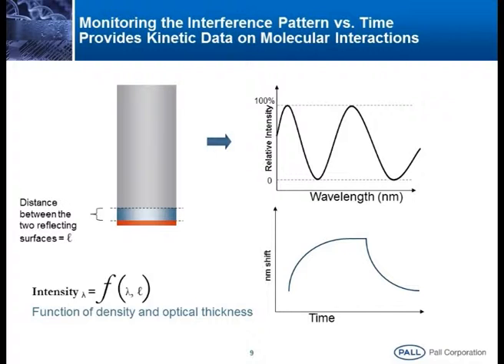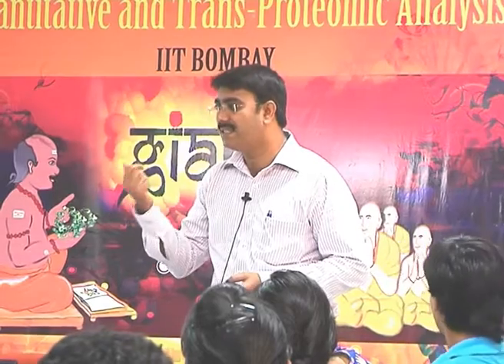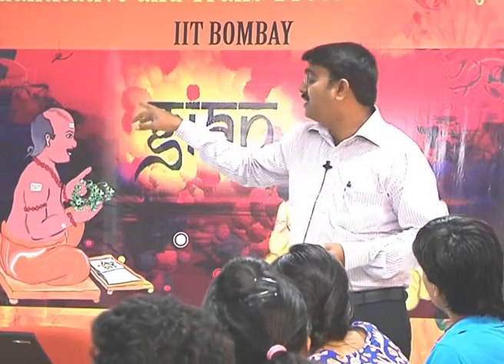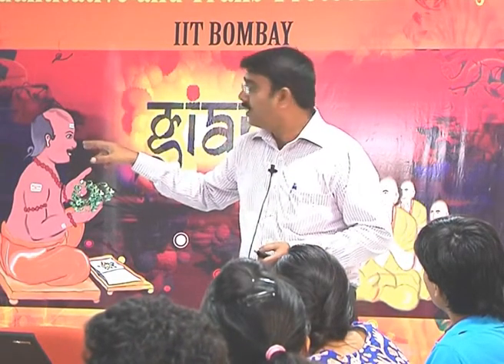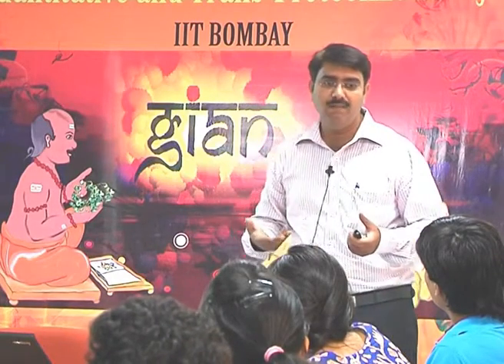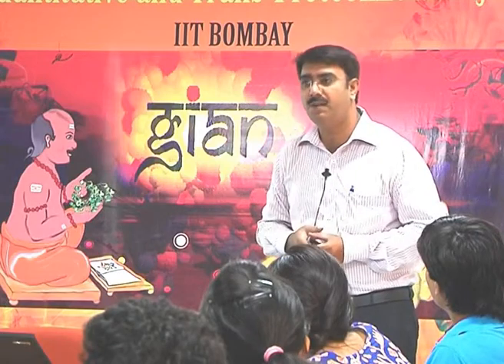affinity. What exactly is picomolar affinity, nanomolar affinity or micromolar affinity? Say suppose in the case of drug discovery, you require a small amount of a drug to elicit a response. Just a picogram of material or a nanogram level, that much concentration is required to elicit a response, or efficacy of the drug, I mean to say. So such kind of things come into the picture here. Less concentration, more response, longer time in the body. That is what we call a strong affinity towards the receptor.